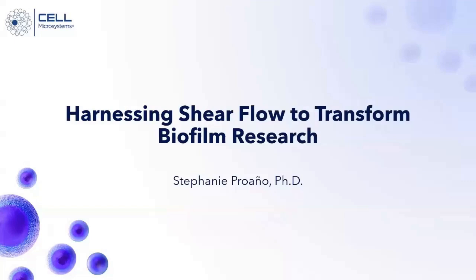Okay, how does Bioflux help with co-culture or multi-species biofilm models that are difficult to maintain in static systems? Yeah, so that goes back to the question earlier. Depending on the plate format, we can load with the two inputs, we could load different multi-species cell suspensions into one microfluidic flow cell, or there are many ways to do this.